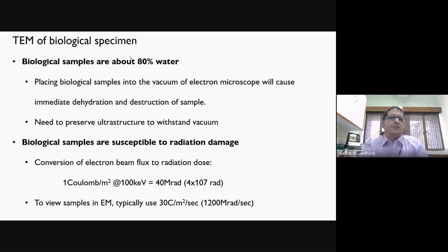And in this vacuum, if you put any of these samples at room temperature, everything will just boil off or evaporate. That's essentially what happens if an astronaut doesn't wear a spacesuit and goes outside and does a spacewalk. It's a complete vacuum, and the body temperature, everything will just boil off. The entire blood will go away. So that's why they need that spacesuit to put some pressure and keep the astronaut protected in space.